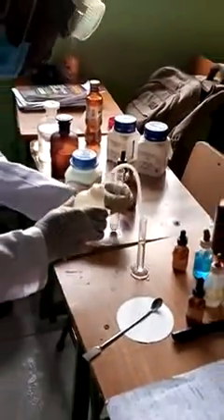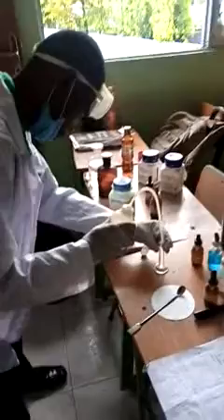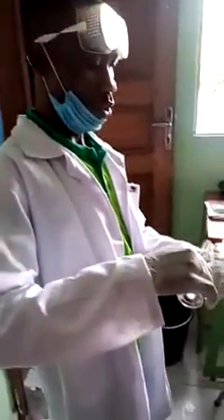If you don't have this, you can just take an approximate volume. It's not a must that it must be exactly 10 cm cube. Do you understand? So you can take an approximate. So this is 10 cm cube of water. So we add it to the salt. And then stir and test with litmus.